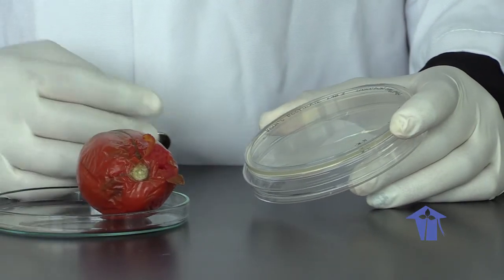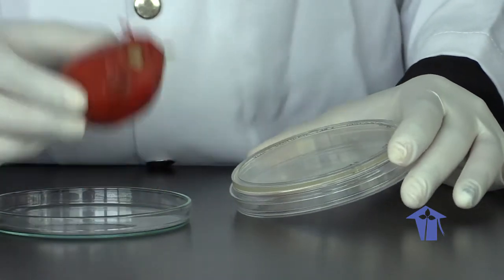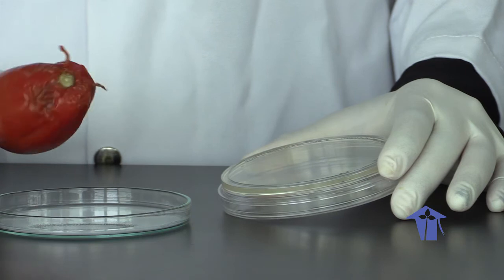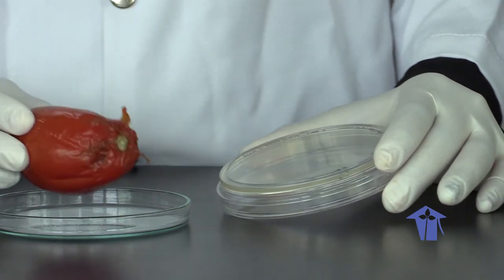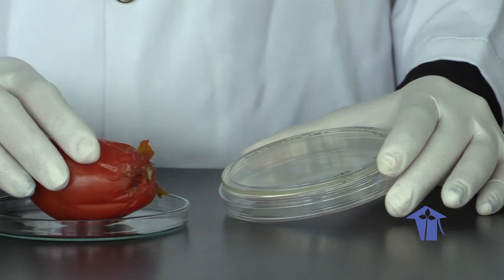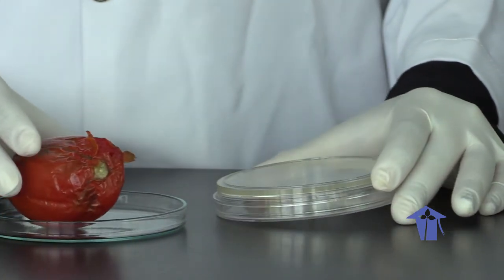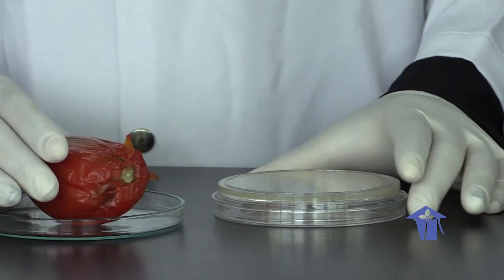So from this first part of your lab, according to Koch's postulates, we would have observed our diseased tomato. For signs and symptoms, make recordings of what signs, symptoms, discoloration of tissue, what type of lesion we see, if you see any substances oozing from the site of infection, and so on. So those things would be recorded as signs and symptoms of the disease being present.